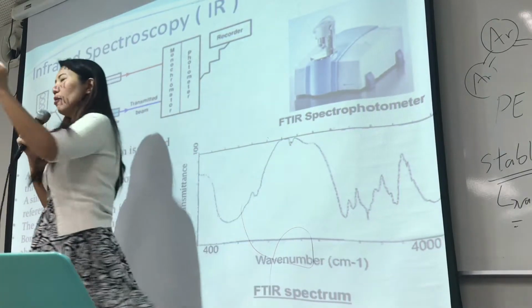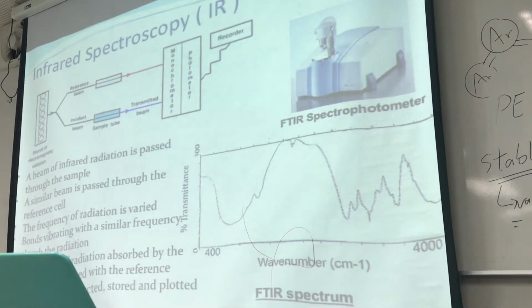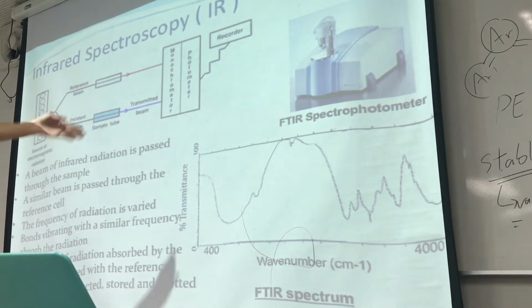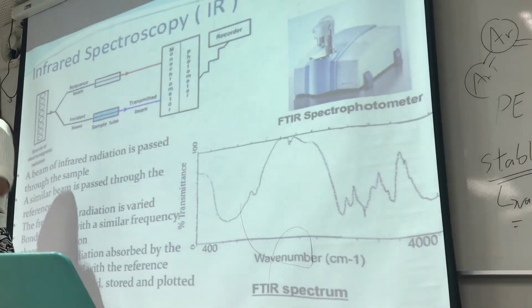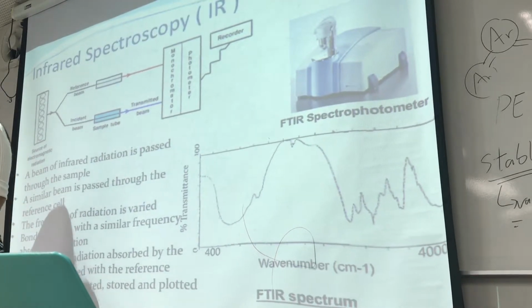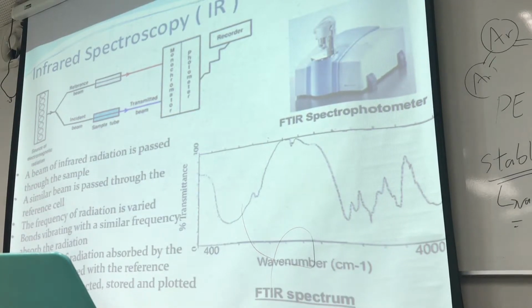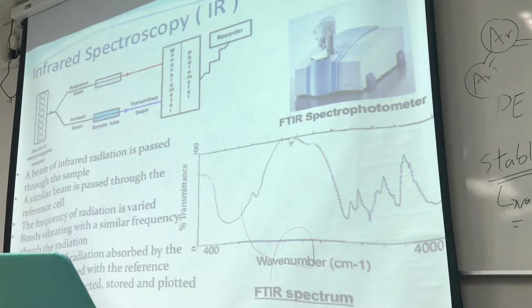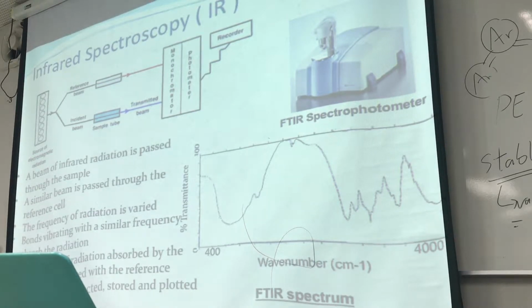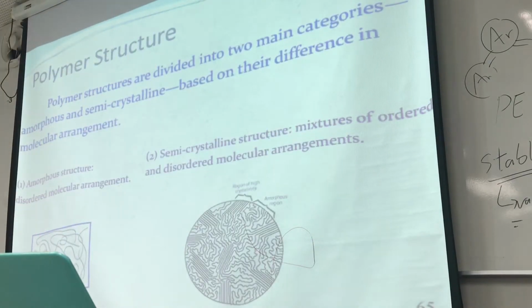You just read the handbook. There is some kind of database telling you that at this range of frequency is a certain bonding. Okay? Simple, in principle it's simple, but actually it's quite hard when you do it. But you just need to know only the principle.